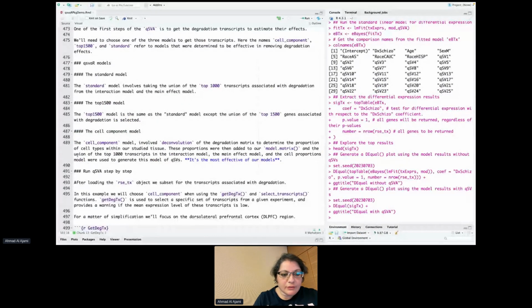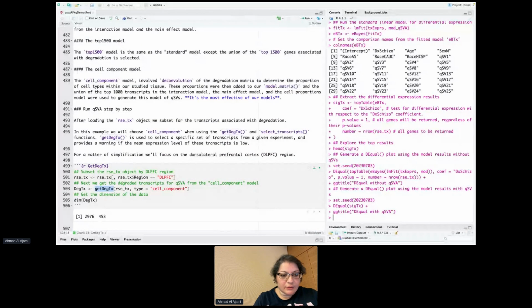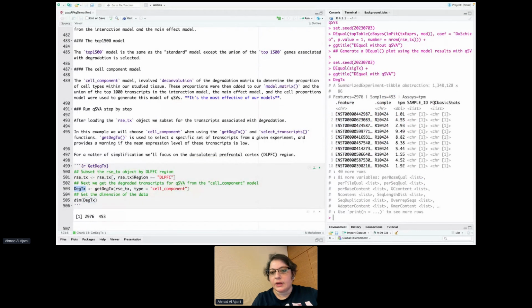So let's have a look at this object. And you will see here that we have the transcript, the sample, the TPM.